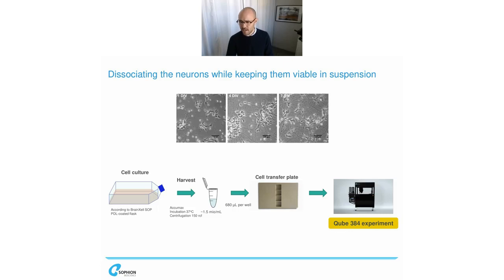And this is really a great feature of the technology because it allows you to do a head-to-head comparison between different cell lines. So you could add cells that were derived from a healthy donor in the first reservoir here, and then you would potentially add your disease model in the second one and add other ones in the others. But that allows you in one experiment to really address and do that comparative study all at once.